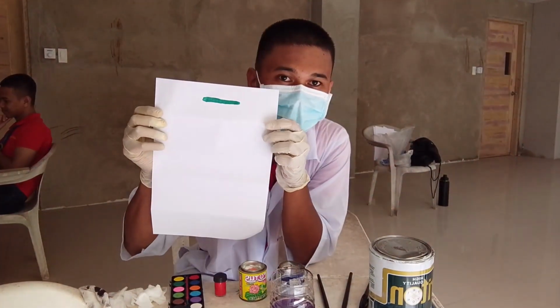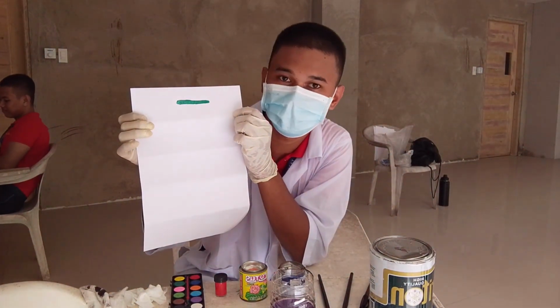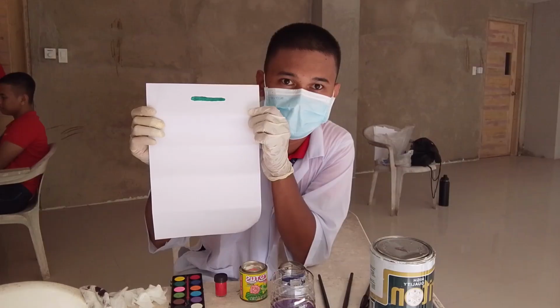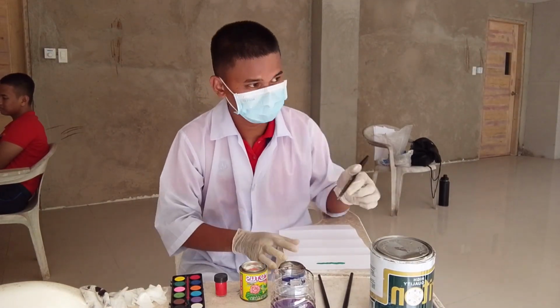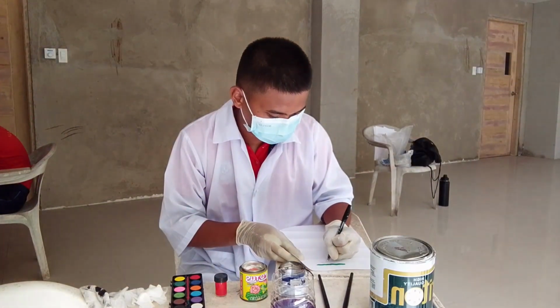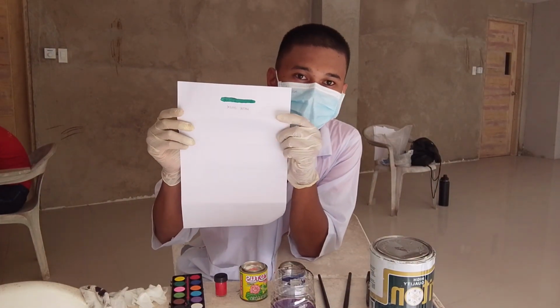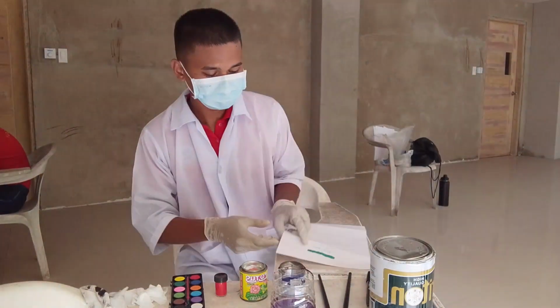So I am done collecting the sample of the watercolor. The color I chose is green, the shade is light, and the paint type is water-based. I will now label it. Watercolor is a type of paint that is used for illustration and drawings.